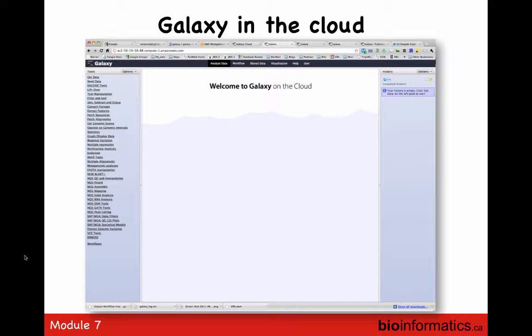This is Galaxy on the cloud — as you can see in the URL bar, it's an Amazon address mapping to an IP address, but it's basically the same interface across all Galaxy instances.